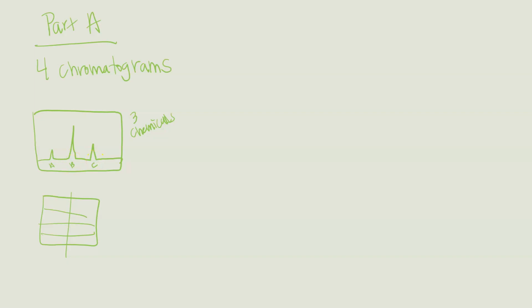By looking at this, I don't know which one's which, okay? But I know that there are 3 of them. And down at the bottom there's going to be a chart below that has, I guess I shouldn't call them A, B, C, let's call them 1, 2, 3, because that's what the instrument does. It numbers them. So 1, 2, 3. I guess there's 3 columns.